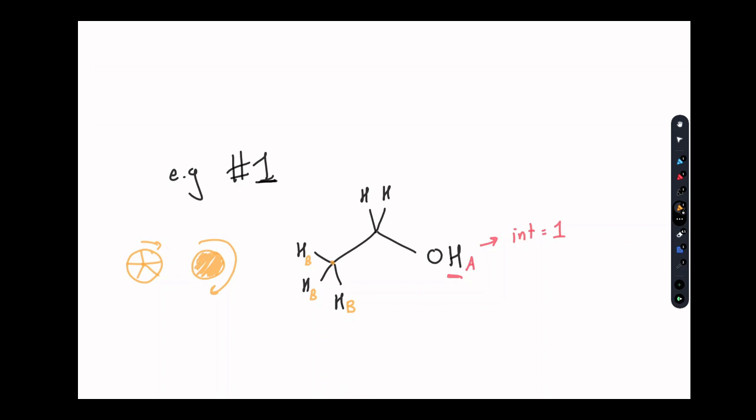They all look the same. That's because our eye has a refresh rate, right? When we see a tire moving, our brain takes pictures and it tries to put them together in video, and that's how I view pretty similar to what the NMR machine is doing. Since these 3 hydrogens are rotating so quickly, the NMR machine doesn't really detect a difference. On average, they're all the same.